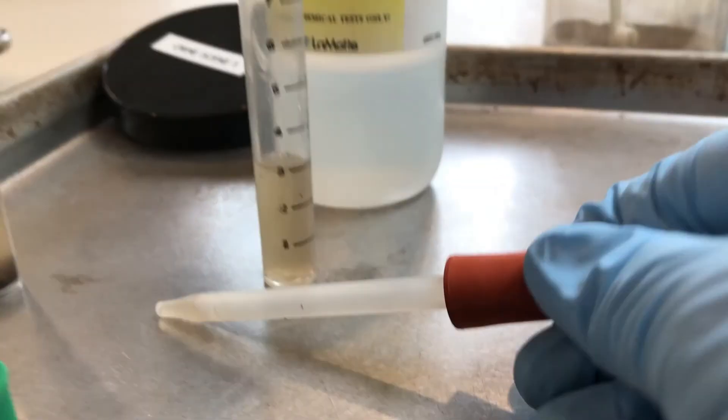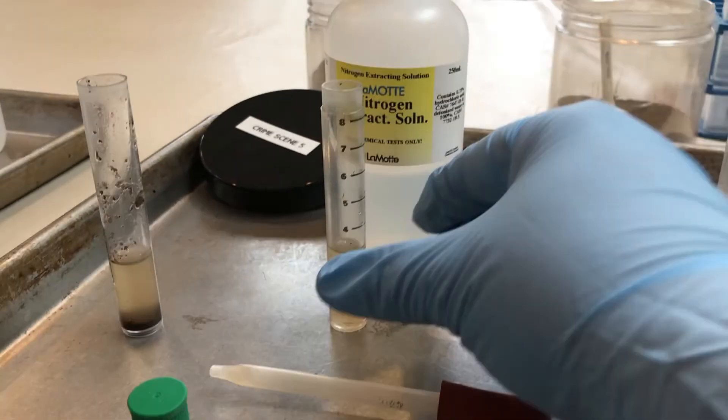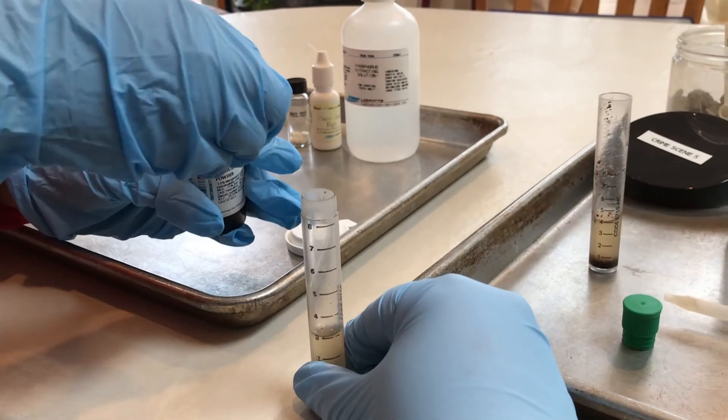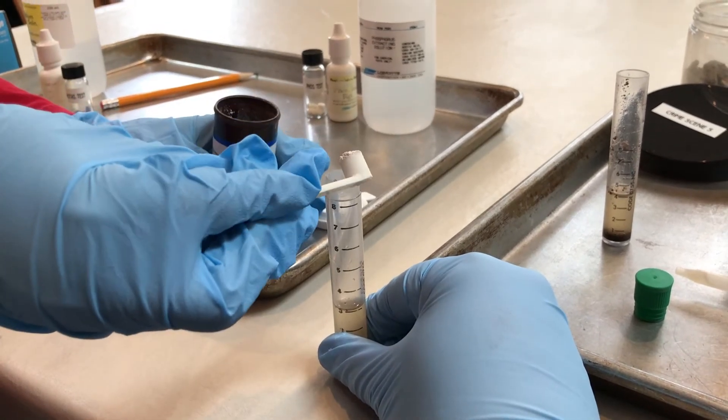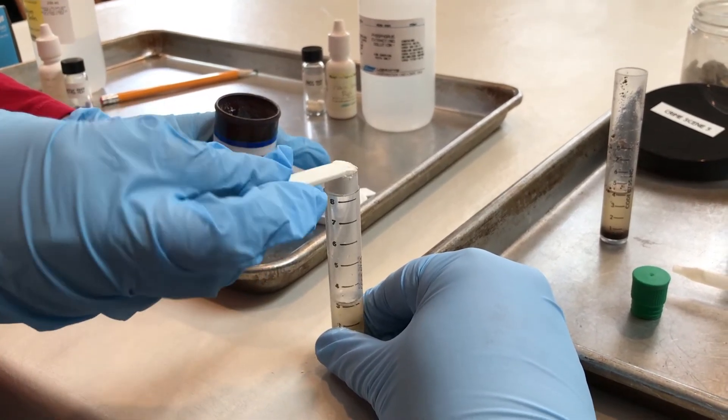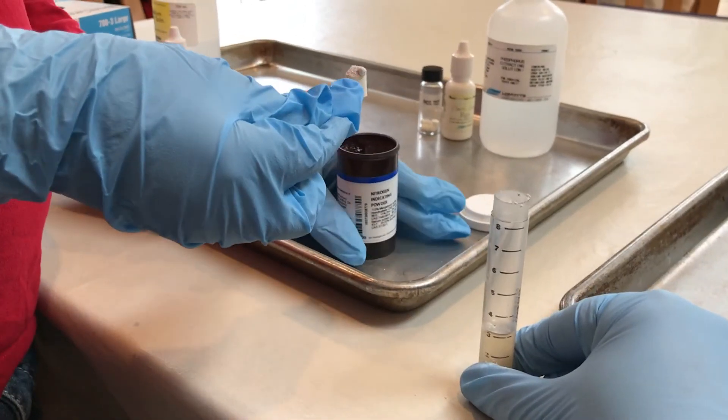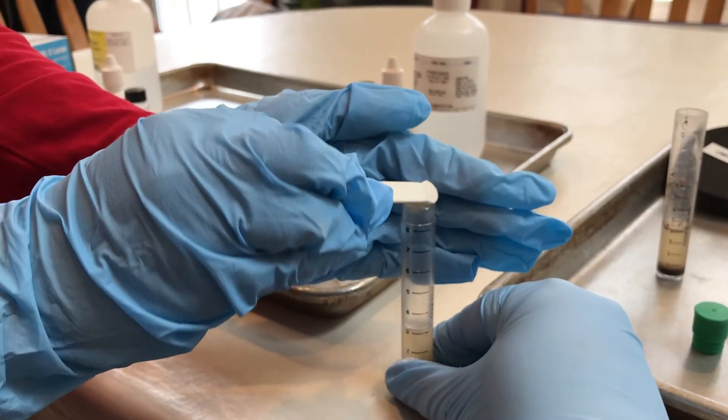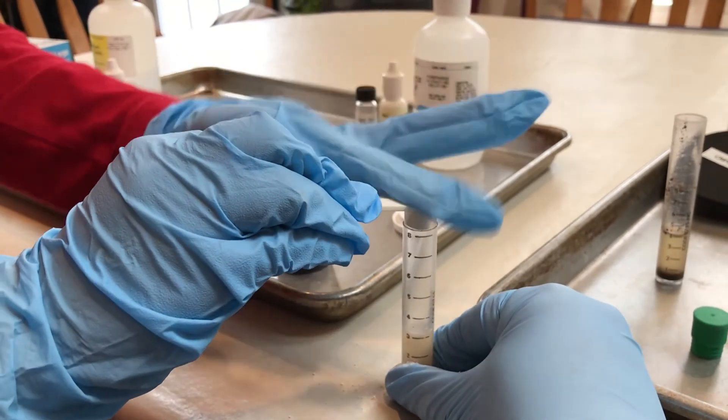Alright, so now that we've done that, Bridget is going to take our nitrogen indicator powder and add two scoops to our test tube. Going to make sure it gets all in there. Make sure you kind of tap it so it can get stuck in the bottom. There we go.